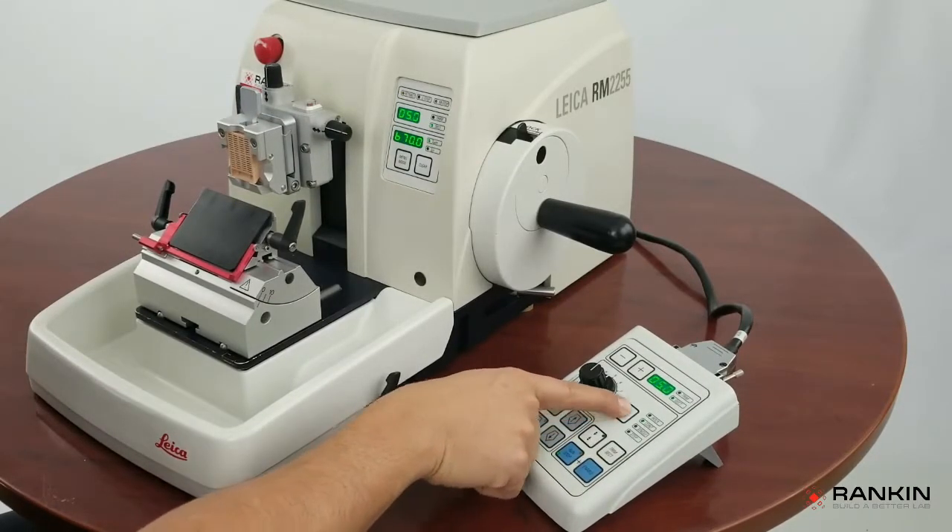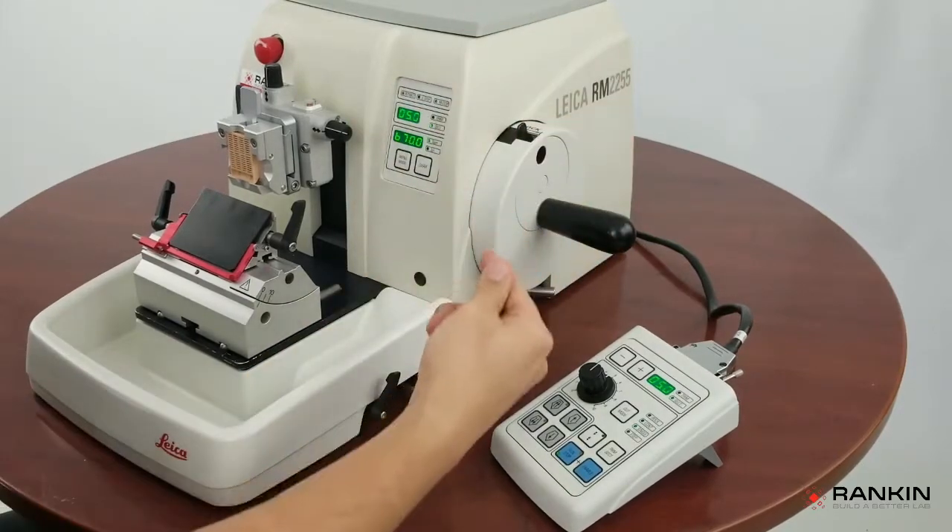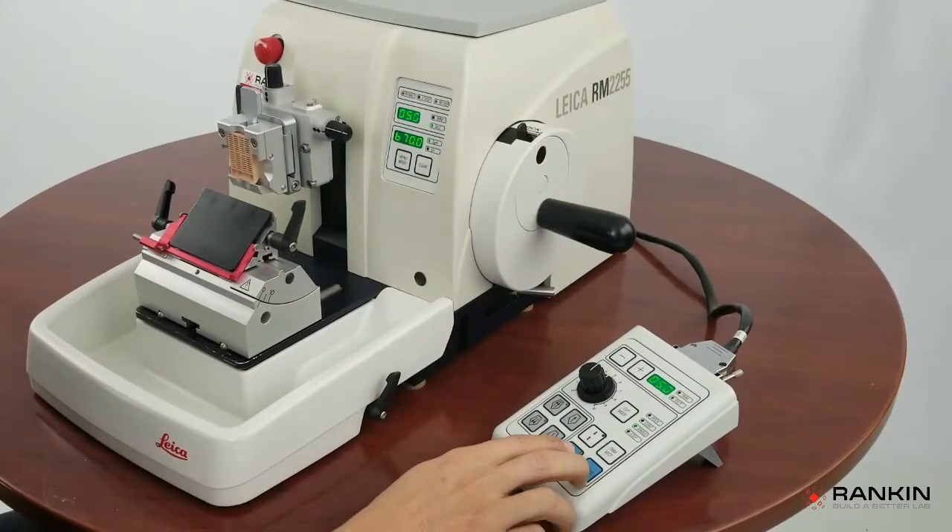The next cutting mode is single. That's going to do one full rotation and stop at 12 o'clock.